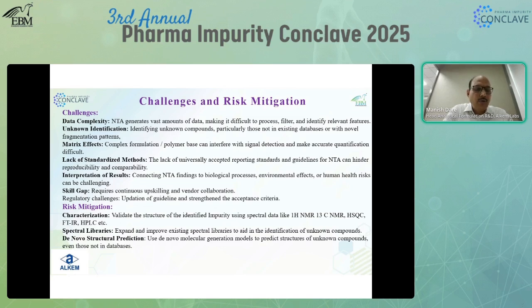And once we generate the data, most companies have an LCMS and triple quad also, but in LCMS triple quad we don't have a library, but for GCMS, of course, libraries are available. Then we have to do the investigation and make the impurities known, and the library can be generated. So this information in future is going to help us not to do the complete investigation.